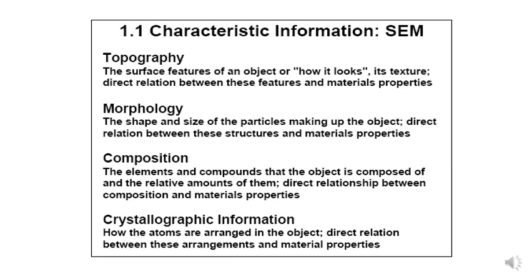As I mentioned just now, if you want to study the composition of your materials, you must make sure that the SEM is equipped with EDX. That is the important thing that you need to know. And the last one is the crystallographic information. This information tells you about how the atoms are arranged in the object. There is a direct relation between this arrangement and material properties.